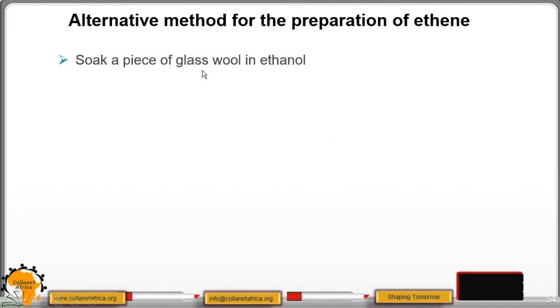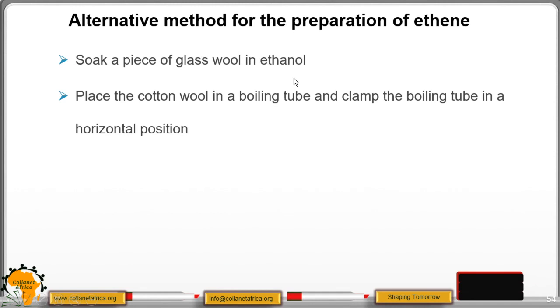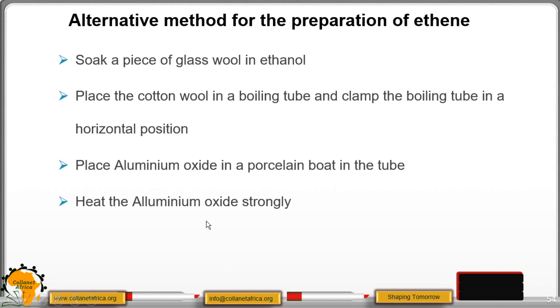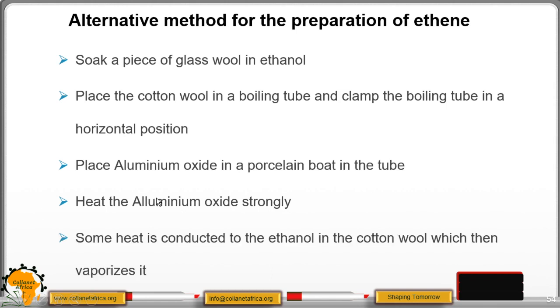Soak a piece of glass wool in ethanol. Then place the cotton wool in a boiling tube and clamp the boiling tube in a horizontal position. Place aluminum oxide in a porcelain boat in the tube. Heat the aluminum oxide strongly. Some heat is conducted to ethanol in the cotton wool which then vaporizes it.